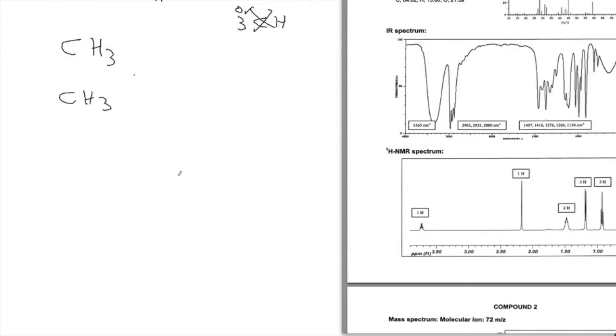But it's probably closer to the electronegative, just a tiny bit closer to the electronegative. Yeah, it's not a very big difference here, but maybe it's a little bit closer to the electronegative group. And then what does this probably represent? Let's see, a CH2 group. Yeah, what else could it be? It could be 2 CH groups, right? But that's actually impossible here because notice there's only 4 carbons and we have 4 peaks. So we basically know each of these is a separate carbon. So we know there's a CH2 group as well.